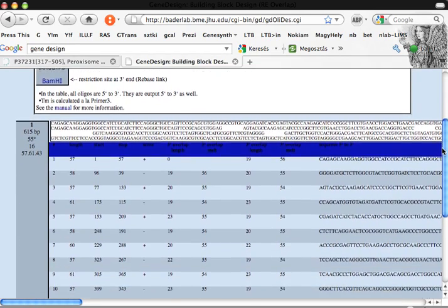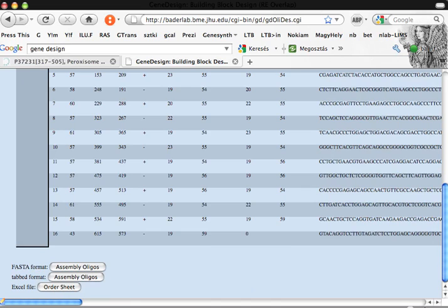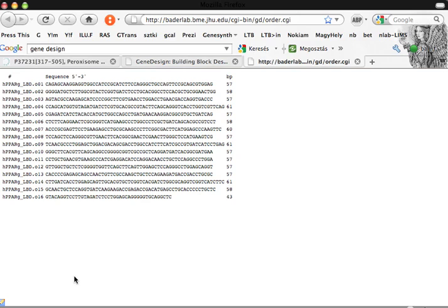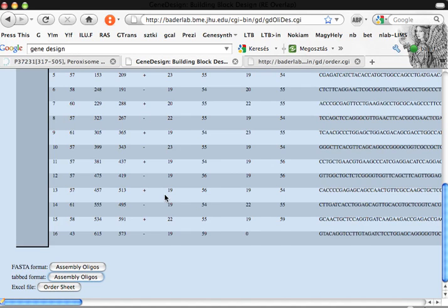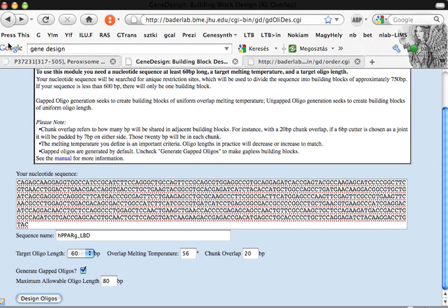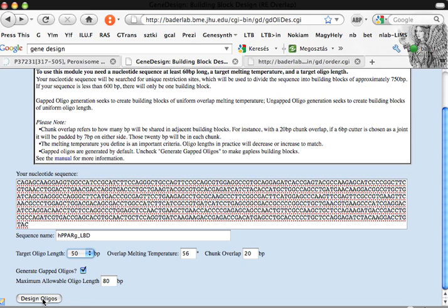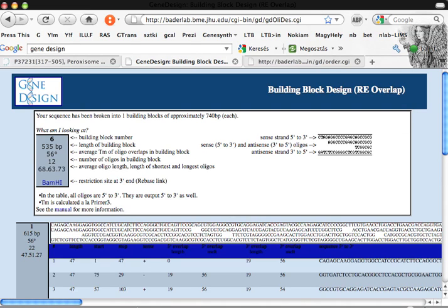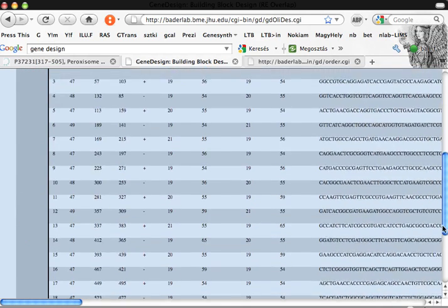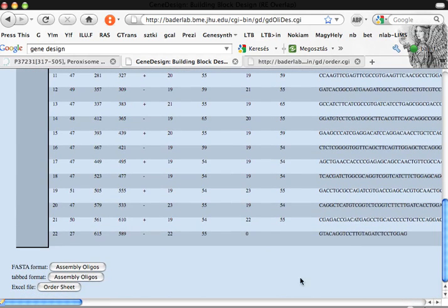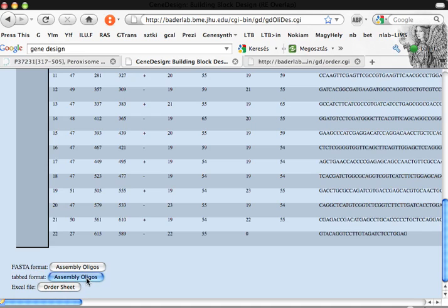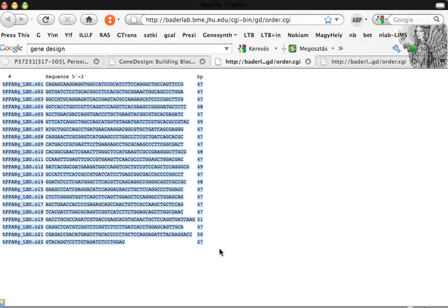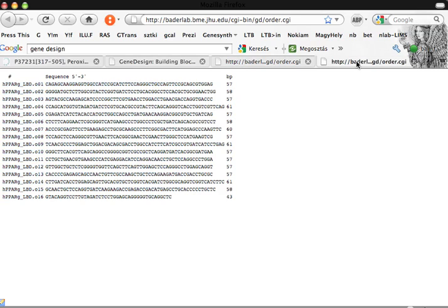Target oligo length should be 60 base pairs, all the defaults here, and design oligos. Okay, this is the result. This can be seen in tabbed format. Two assembly oligos. We can generate this from 16 oligos that can be ordered individually. If we would like to use shorter oligos, we can put here 50 base pair long oligos. In this case we have 22 oligos. It's worth saving both lists.